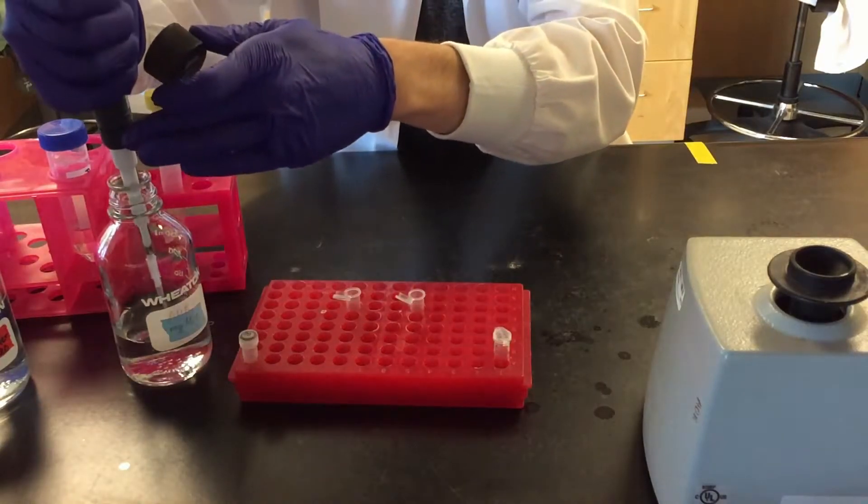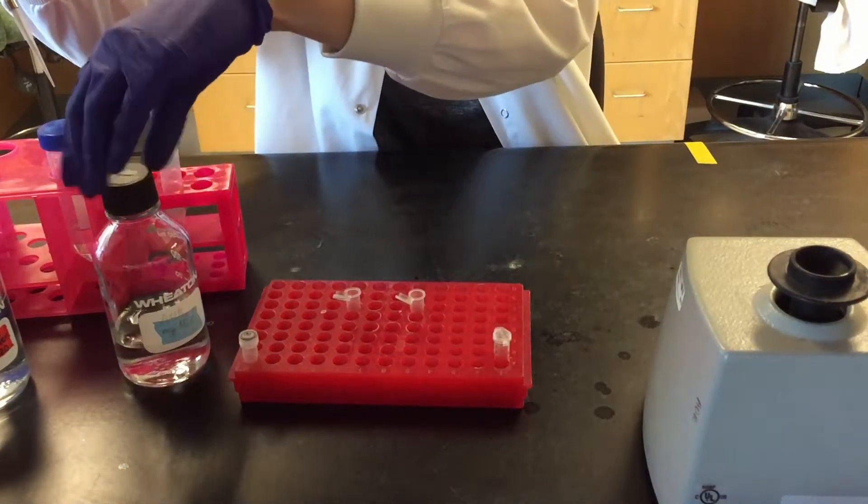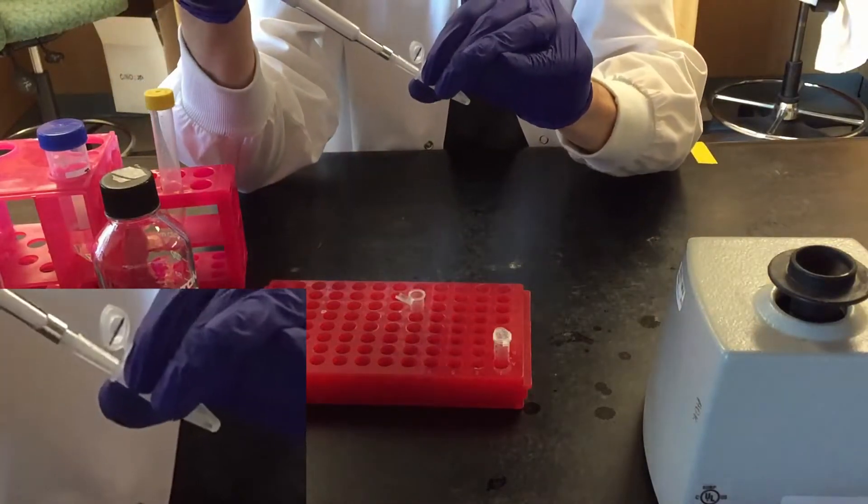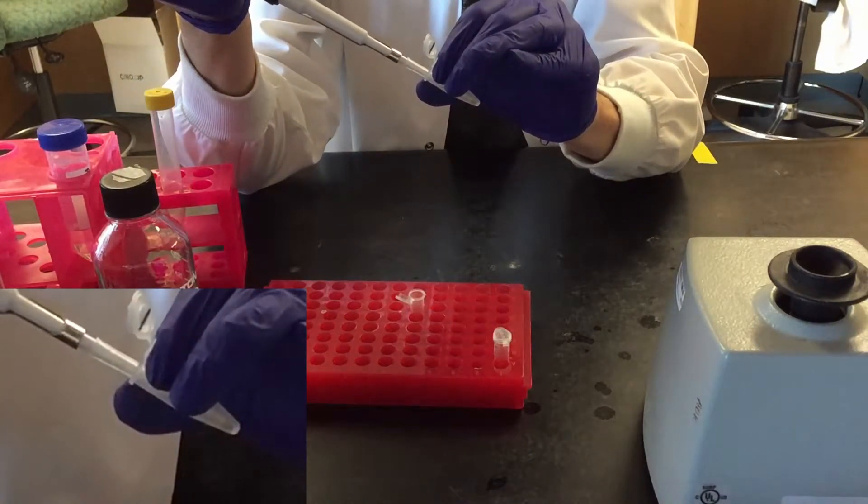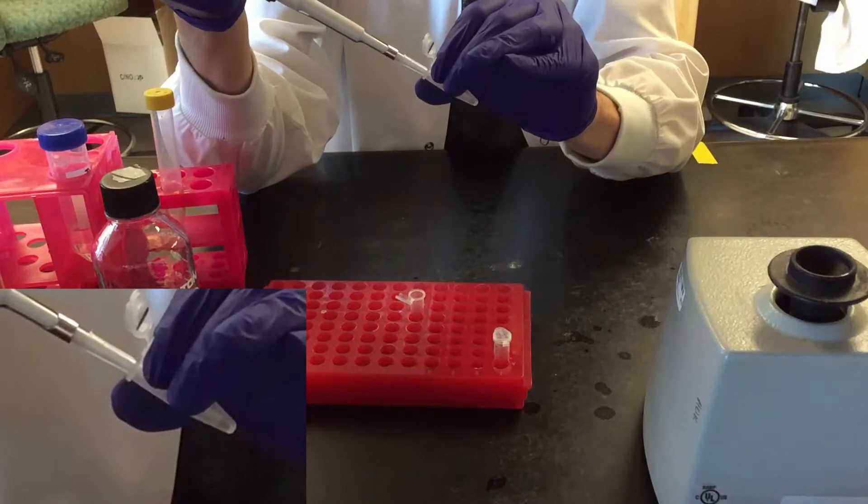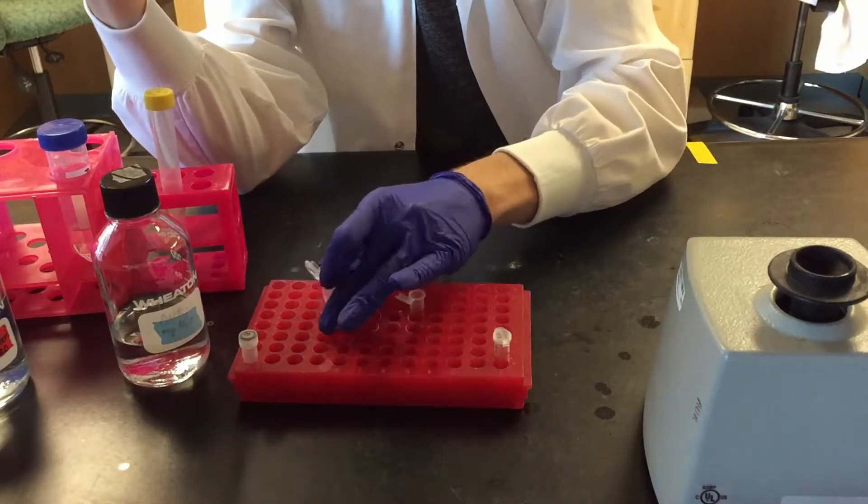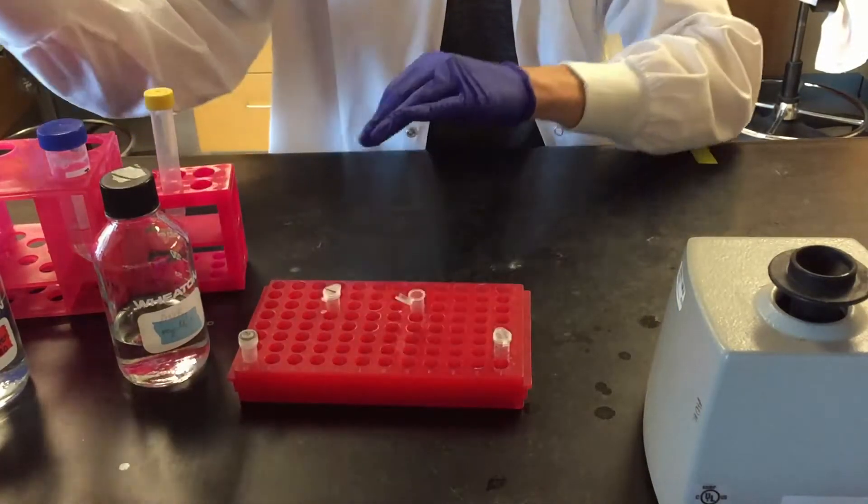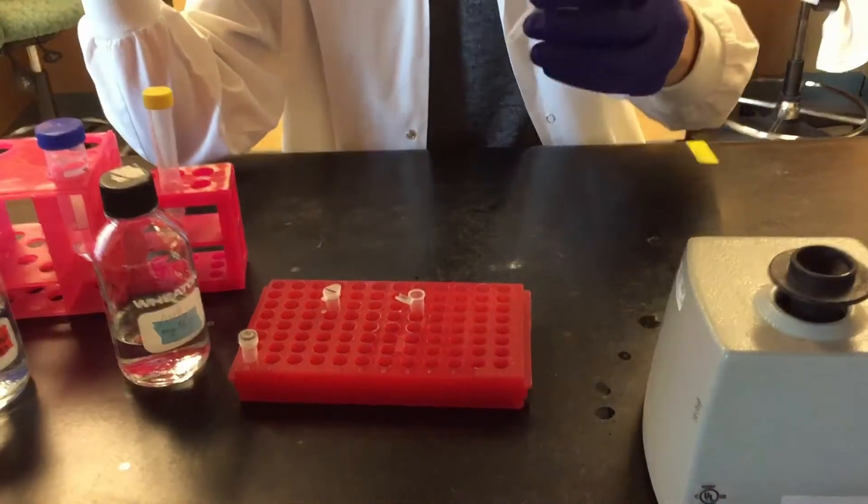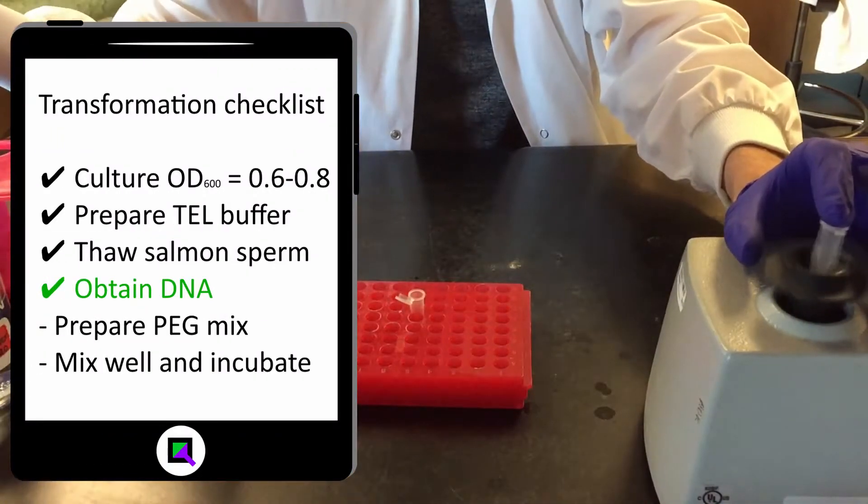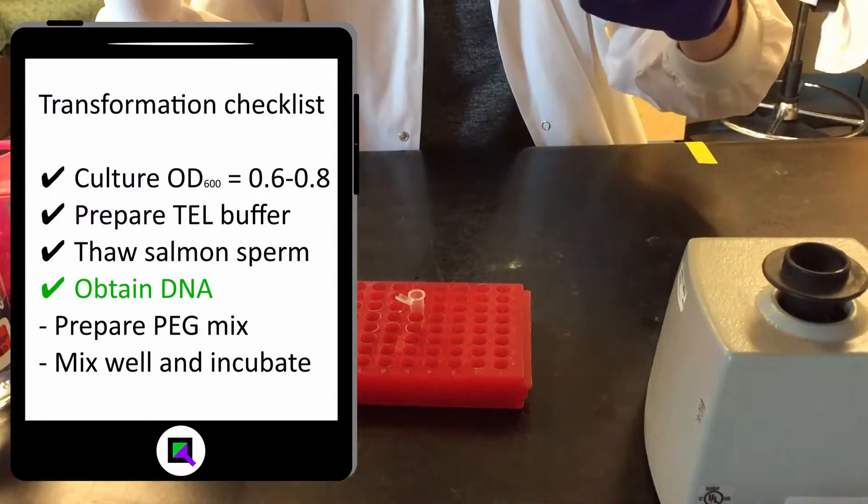Add 5 to 10 microliters of water to the negative control. Add 5 to 10 microliters of the plasmid or PCR product to be transformed.